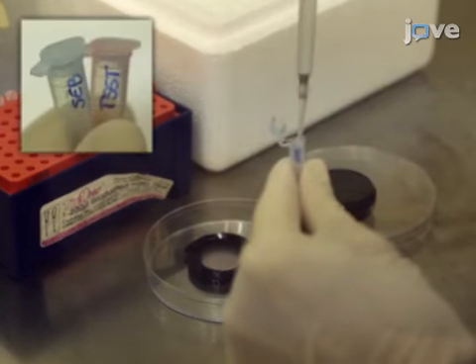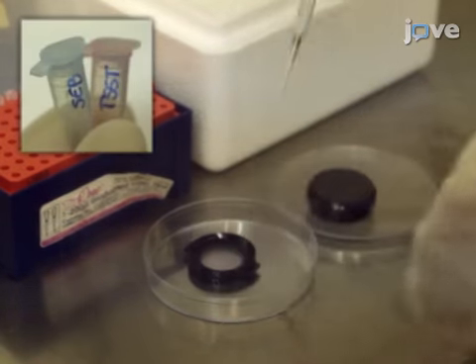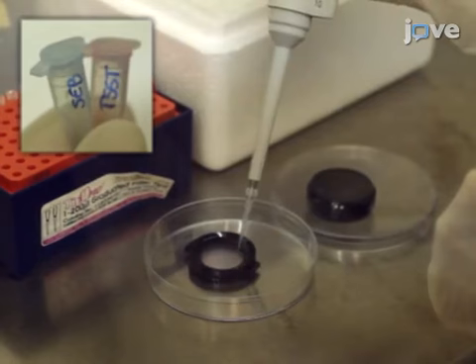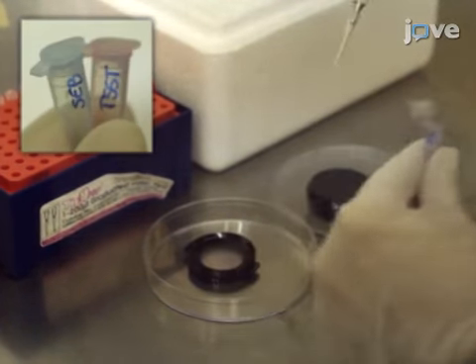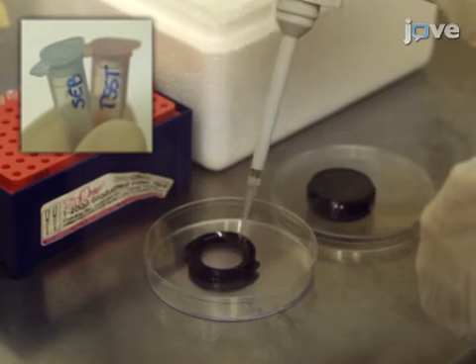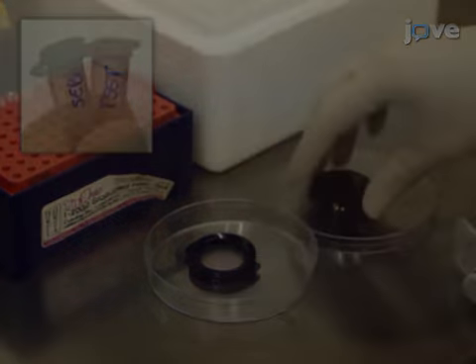On day 3, 30 to 60 minutes before starting the experiment, incubate the endothelium with 1 microgram per milliliter each of the bacterial superantigens Staphylococcal enterotoxin B and toxic shock syndrome toxin 1.